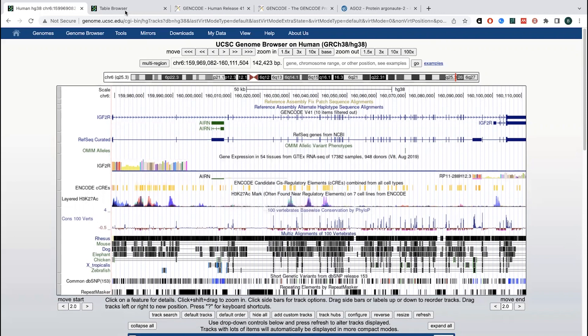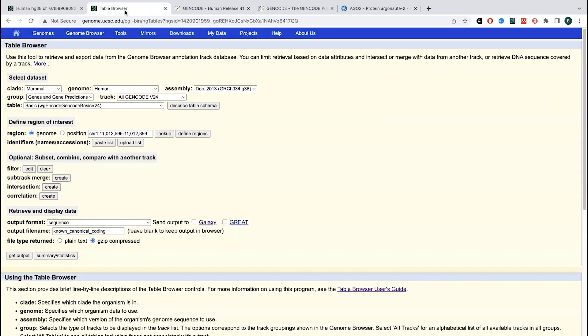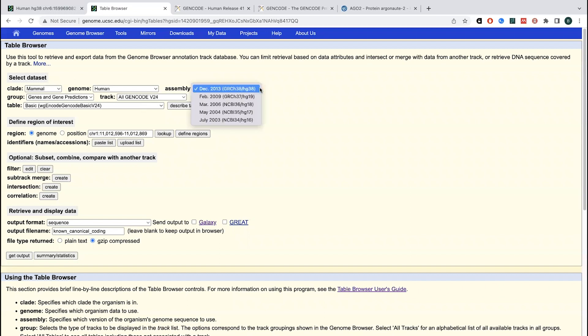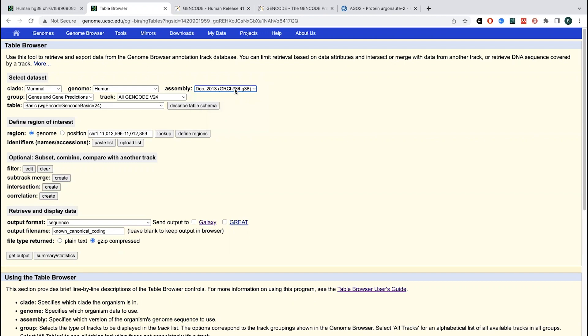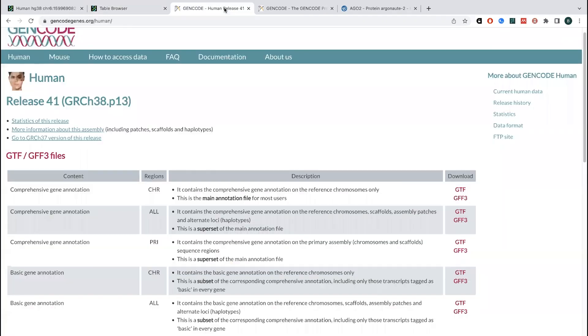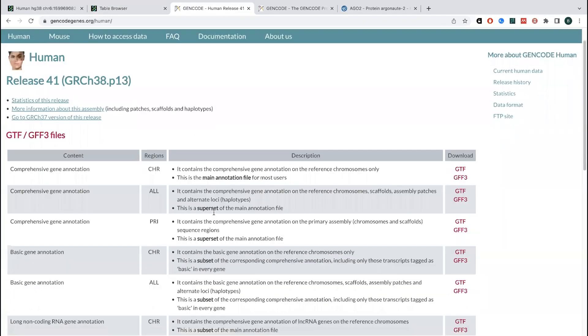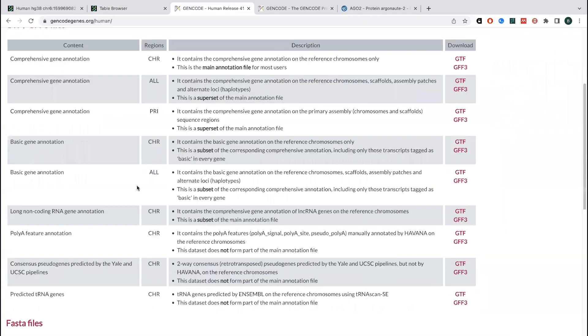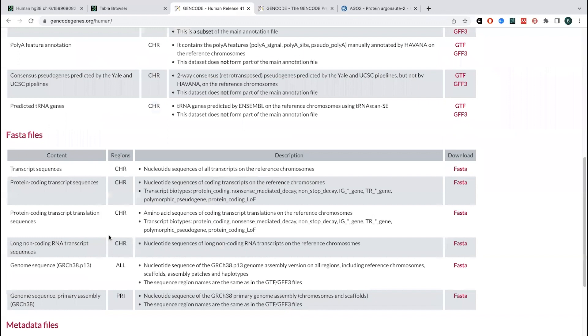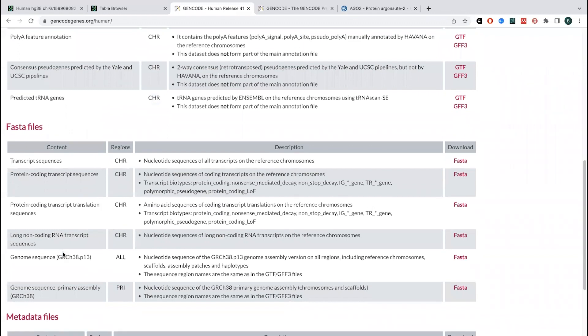If you want to actually download the data, you can go to their table browser. Here you have the assembly. This is going to be basically just the sequence. And so the current assembly for human DNA is going to be this GR, this H338 or GR38. And so basically you can get this down as a FASTA file.